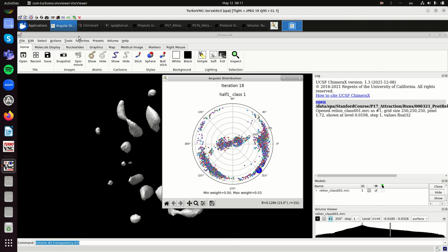So we see that most of the particles have been placed in one of the directions, in one of these axes here. While if the thing is symmetric but we don't know, we should expect that they are randomly distributed along the circle, just occupying all the possible equivalent positions. And this makes sense from the point of view of the objective function.